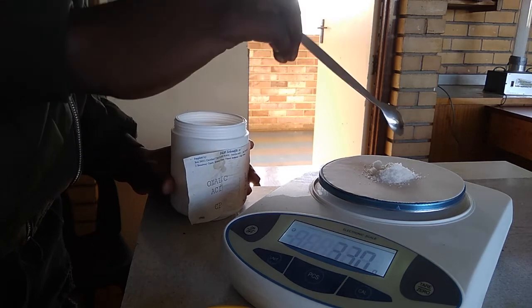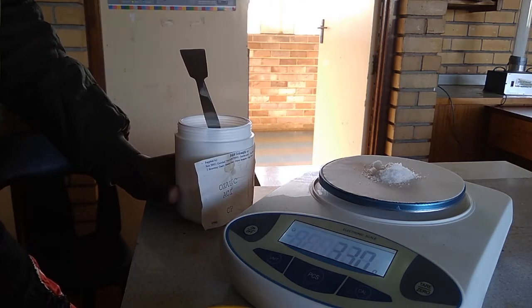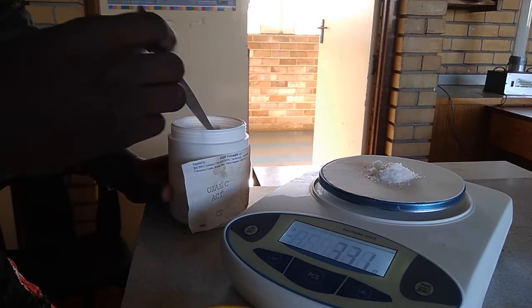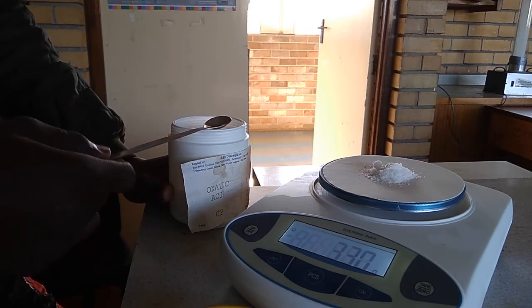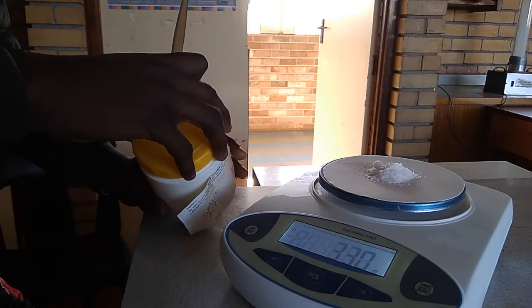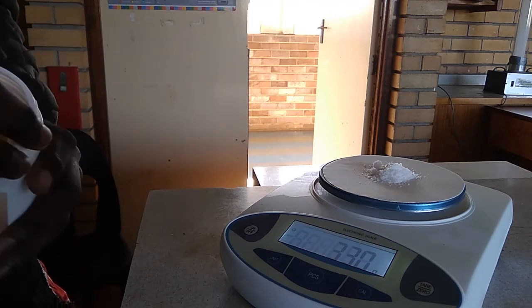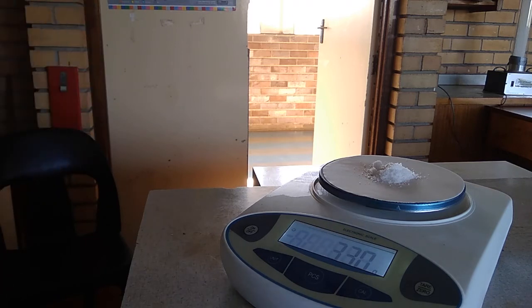Okay, now give us a reading for that. 3.3 grams. How much? 3.3 grams. He's right. Is that all? Okay. 3.3 grams oxalic acid. So in your method, you're going to explain how you did that. Everyone happy with that? Thanks a lot. Stop and then just clean your hands again after. Was that difficult, folks? No.